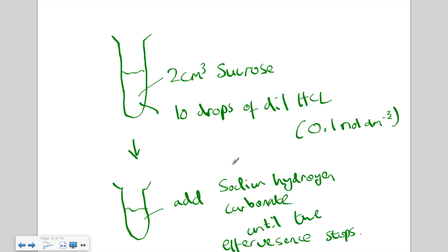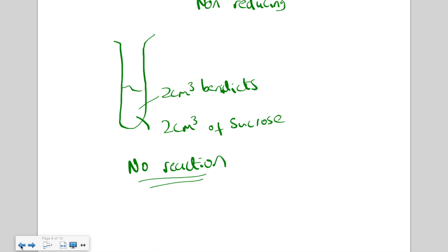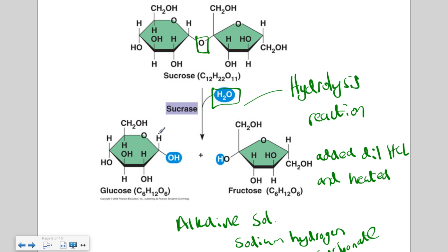So once we've done this, this should have hydrolyzed the sucrose. So this stage breaks the sucrose down into glucose and fructose. Don't worry about this at the moment, this is an enzyme, this isn't relevant to our discussion.